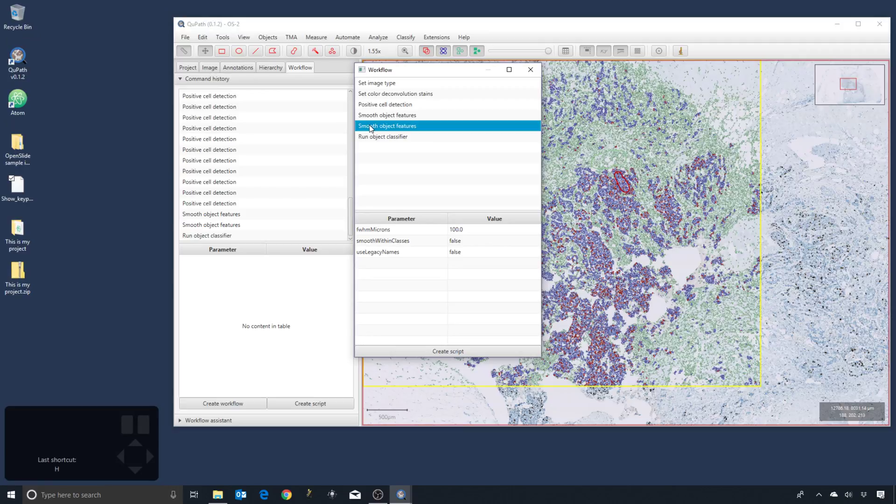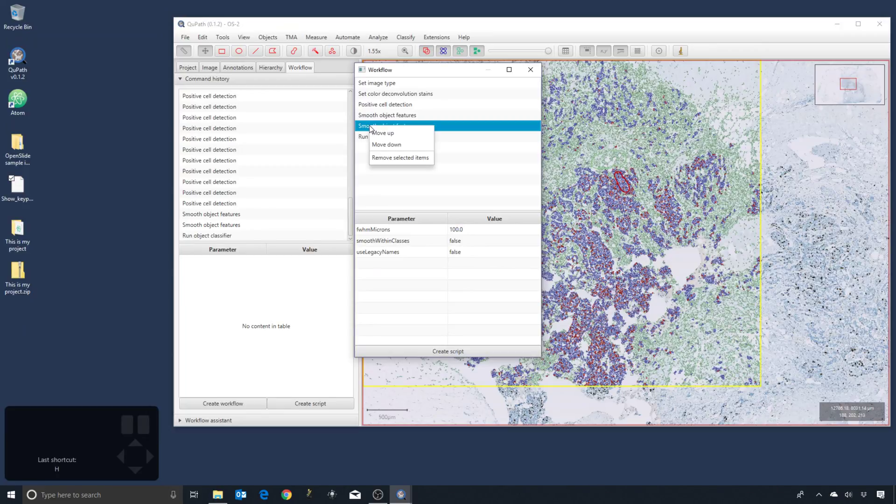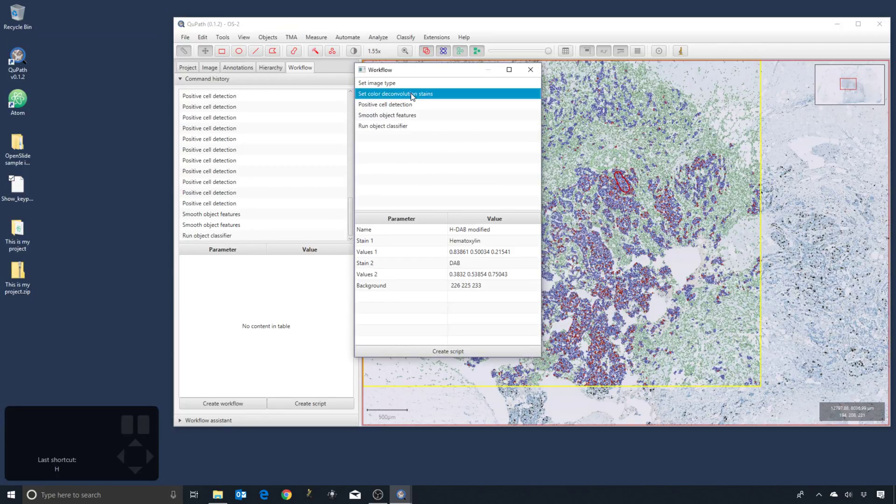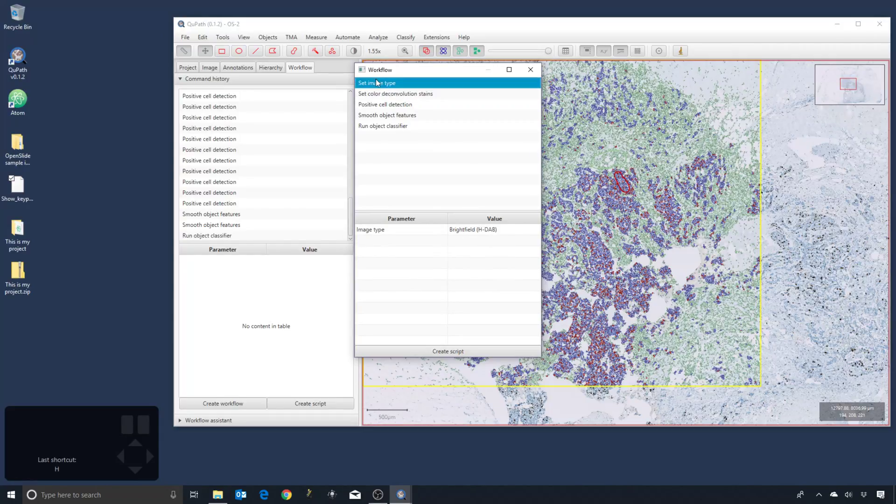So we can still do the calculations if we want, and we certainly would need to if we use them in the classifier. But because we didn't, we can actually remove the smooth features as well.